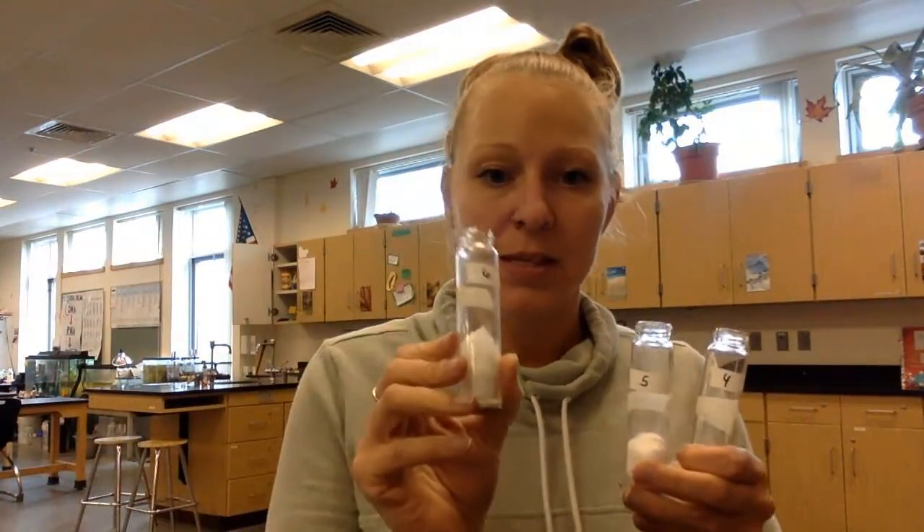So I have respirometer one with 25 germinated peas, respirometer two with dried peas and beads, and respirometer three with just beads — all at room temperature, 25 degrees Celsius. Then I'm going to repeat this setup for respirometers four, five, and six, which had 25 germinated peas at 14 mils volume, 25 dried peas with beads to reach 14 mils, and just beads.